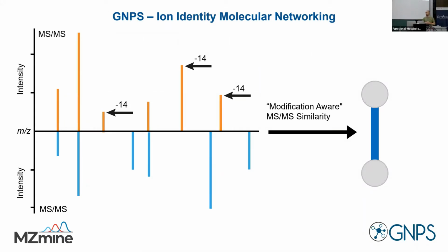And we hope, of course, everyone here hopes, it's one known thing and one analog of a known thing, right? Which is the new compound we want to discover. So we already look at something that has a precursor m/z difference. If we just look at the precursor m/z difference here, it's shifted by 14. So we can very easily conclude it might be just a CH2 of difference.